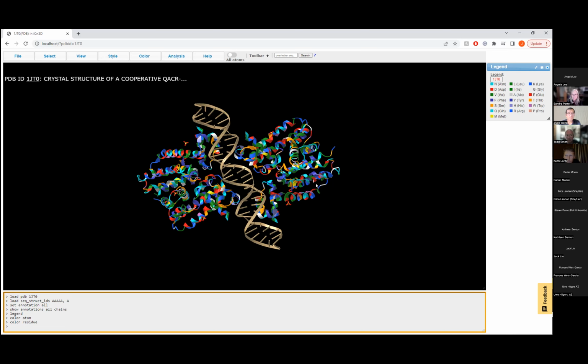And it's one of the things we put into Molecule World: what are the amino acids in this protein, and where are they, when we get into antibodies and those paratopes. It's really nice to be able to highlight a region and then see the names of the amino acids rather than trying to mouse over them. And so there's an overall effort in how we adapt this program in ways that we can use it in the classroom.